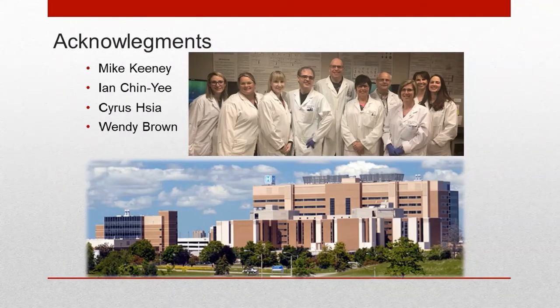Okay, thank you. So for this assay that you've been discussing, is this something that can also be run on other instruments, or is this specific to the Navios flow cytometer?